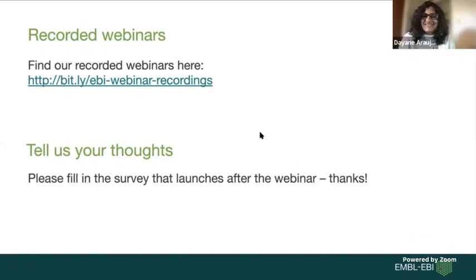It's really good. Okay, Animesh, which deep learning library, PyTorch or TensorFlow, is recommended for doing things like image clustering, cell counting, and so on? I'm not the super expert here, but I'm also not sure if this is really typically done with deep learning. In Python there is this whole library, I think it's called scikit-learn, you will find it. It has stuff for general machine learning, not necessarily deep learning. I think clustering, for example.